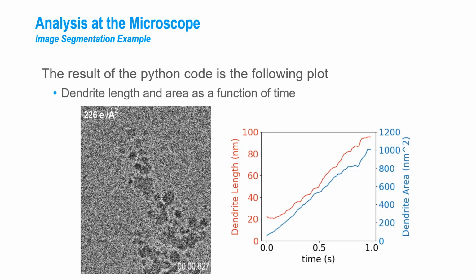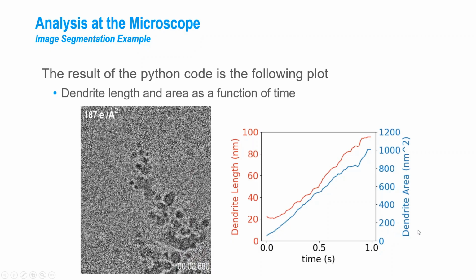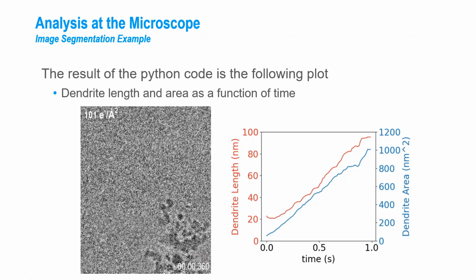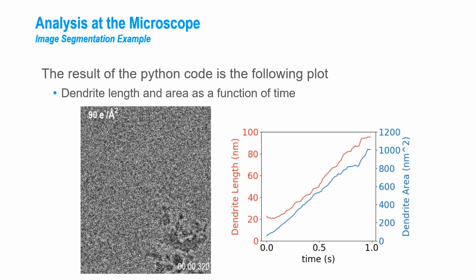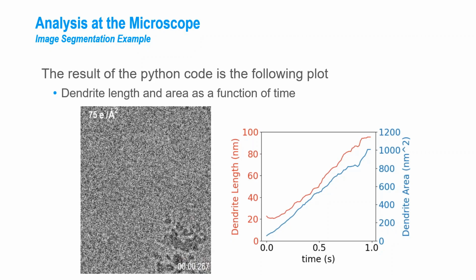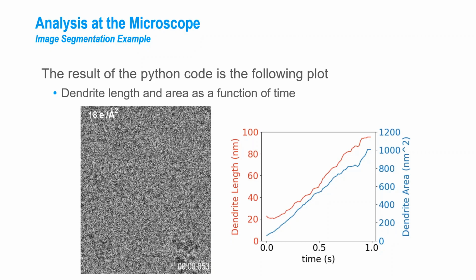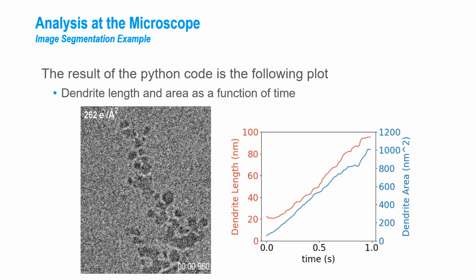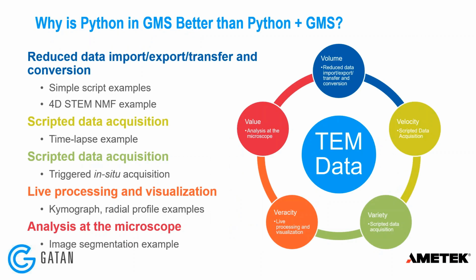And so now I've gone from my original data video to a plot of the dendrite length and area over time, what I wanted. And I probably wrote this script in about a week, not spending all my time on it, but a fair bit of time over a week, actually for an abstract for a conference, which hopefully I will still have a chance to present this summer. We'll see.